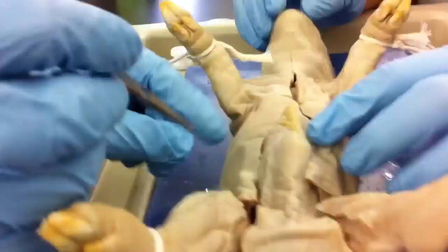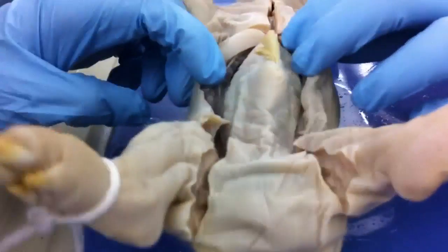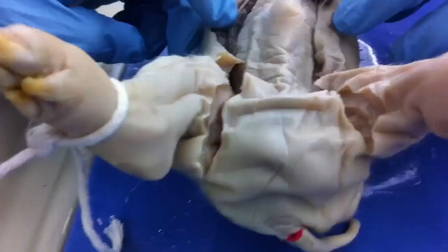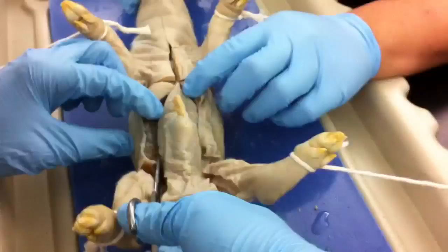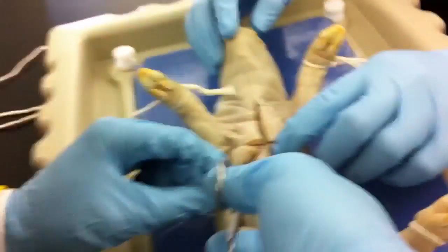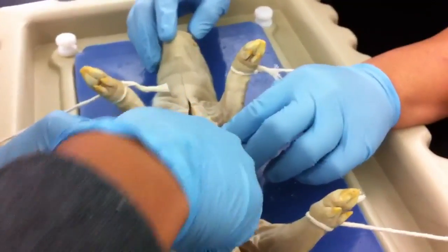Alright, guys. Just finish it off. You got the pins here? Yeah. You guys ever seen Independence Day? Yeah. What are you saying? It looks like the aliens or something. This kind of reminds me of the scene when the scientist was trying to dissect them and then it turns alive and it kills them.